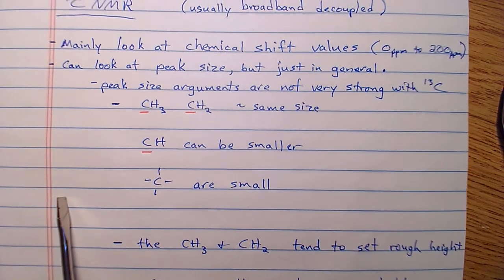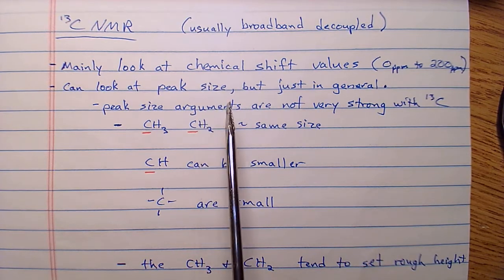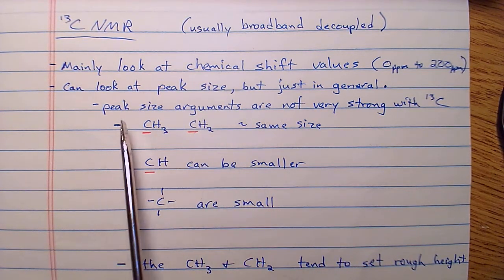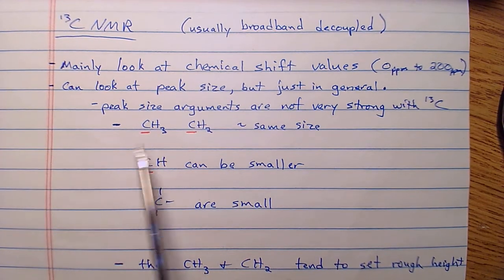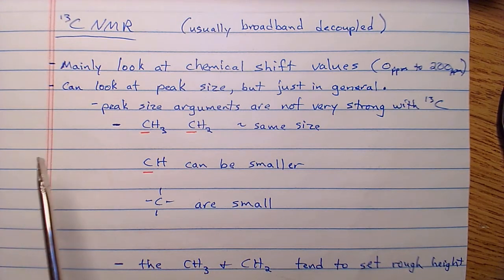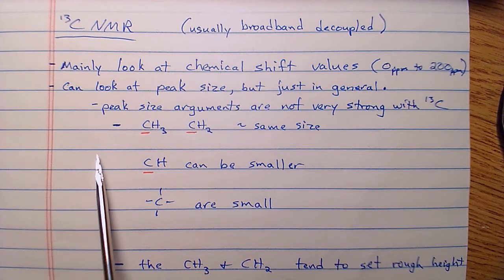Something else that we can look at, though, is the size of the peak. But this is just very, very in general. You cannot make very strong arguments based on peak size, but you can kind of say, oh, this is leading me to believe this. Based on the height of this peak, that leads me to believe that this is the case. Let me explore that further. Let me find more data to confirm it.